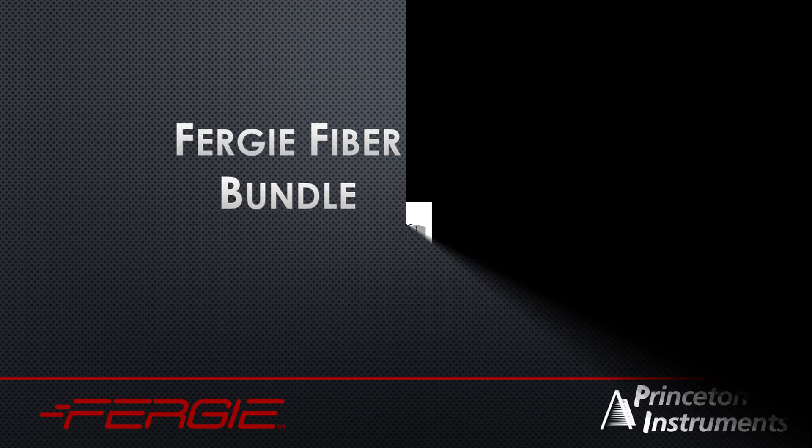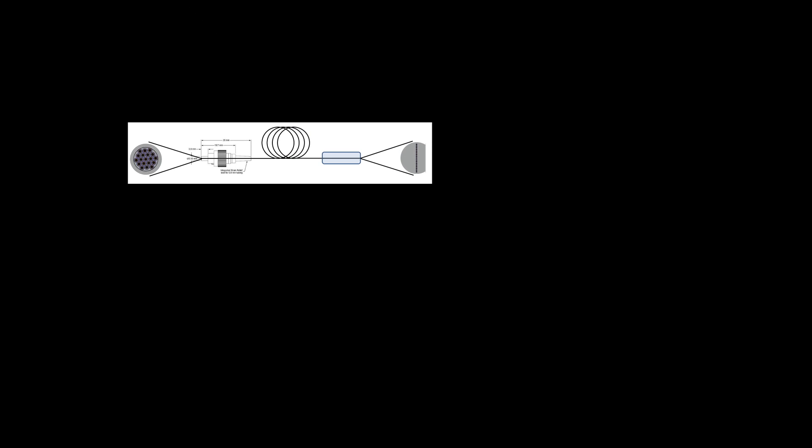The Fergie fiber bundle captures more signal from your experiment using 50 individual fibers. The spectral resolution of the measurement is maintained by distributing the fibers along the Fergie entrance slit. A Fergie separation-free, diffraction-limited imaging system keeps the spectral information of each fiber output separated.